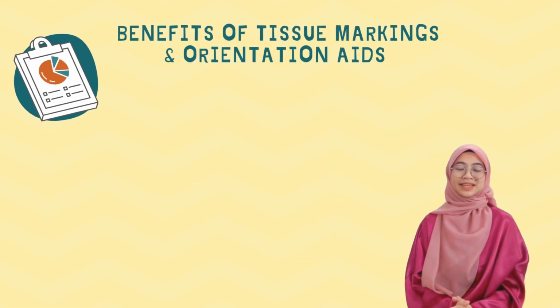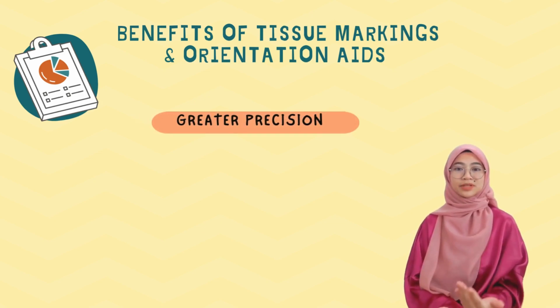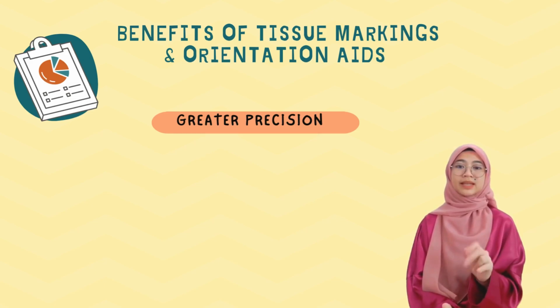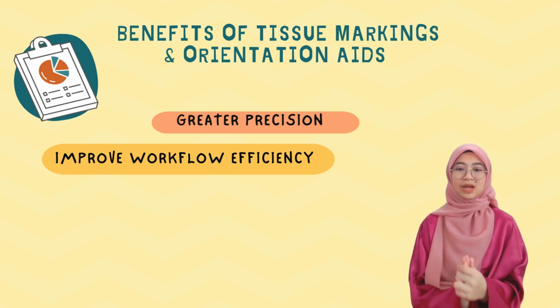At the grossing stage, these new techniques offer several key benefits. The first one is greater precision. This helps laboratories to clearly identify important tissue areas with the help of high-contrast markings. Second, improved workflow efficiency by reducing the time spent handling each sample and reducing manual handling errors.